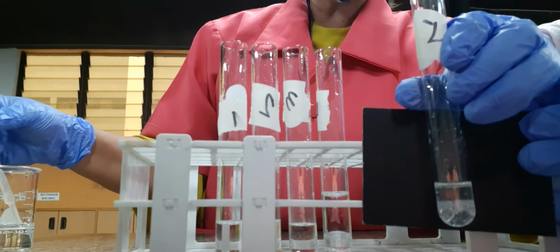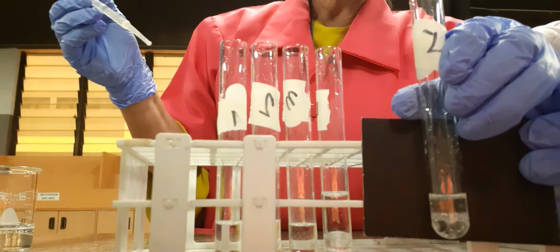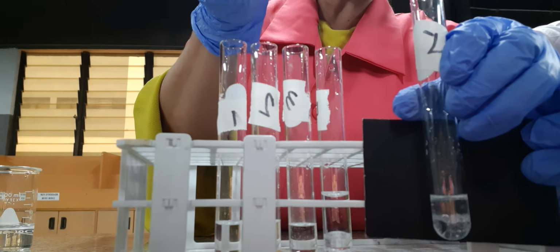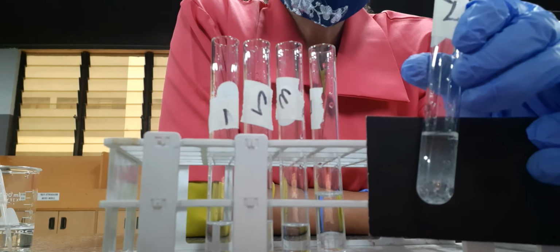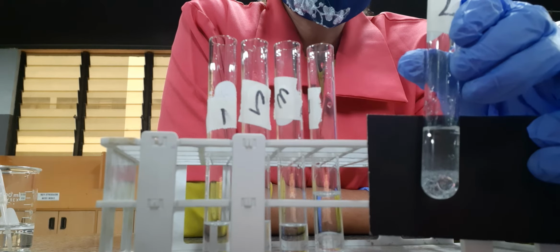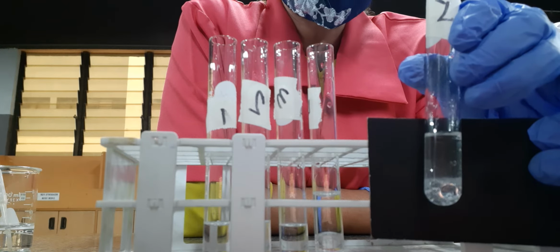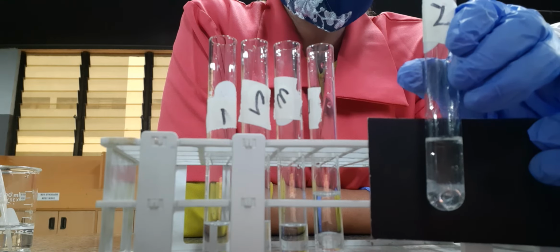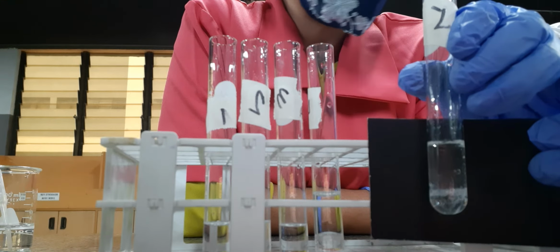Once again, we'll test with another volume of water, and we'll see that the volume of water is now increased, and let us determine which one sinks at the bottom. Very clear here that our acetophenone lies at the bottom and our water is on top. So acetophenone is denser than water. So they are immiscible.